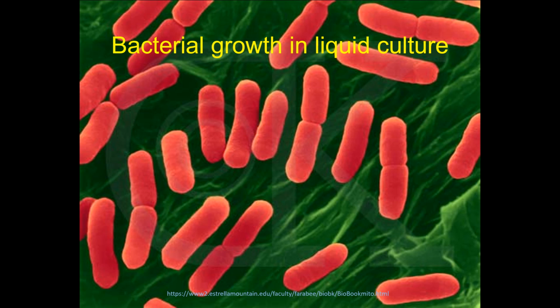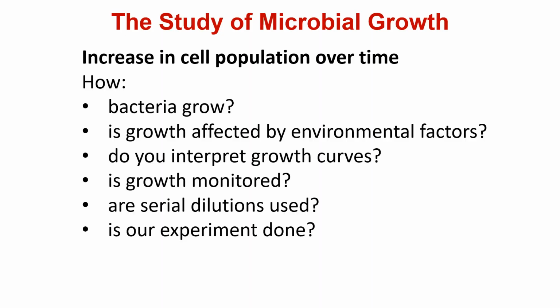Okay, today we're going to talk about growing bacteria in liquid culture. So we're going to look at basically how a cell population increases over time. And so we need to know a few things.